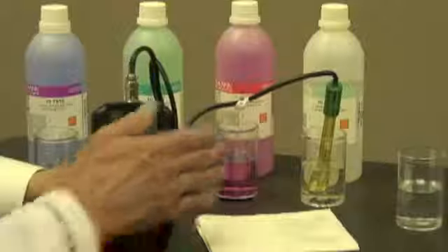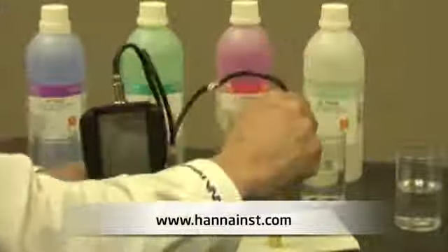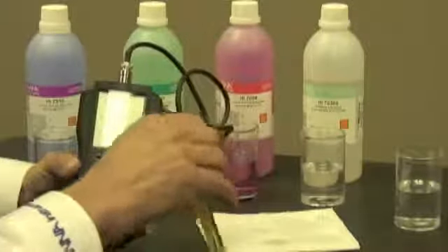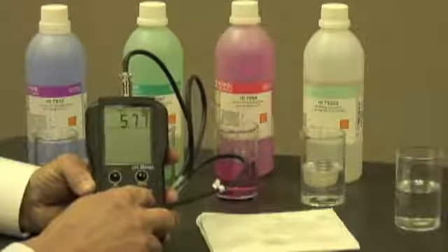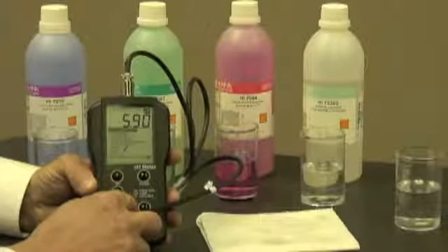Once the two hours is up, I'm going to take the probe out, rinse it off in purified water, then dry it on a paper towel. Now I'm ready to calibrate. I'm going to turn my meter on and let it go into its startup measurement mode.